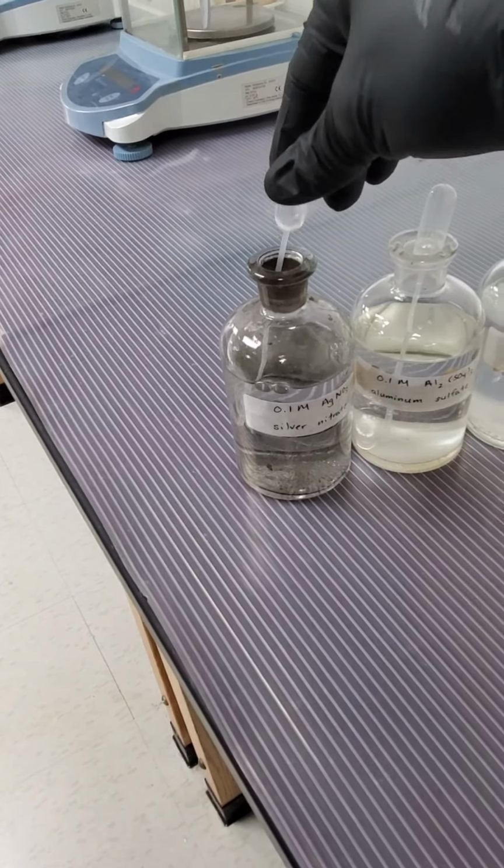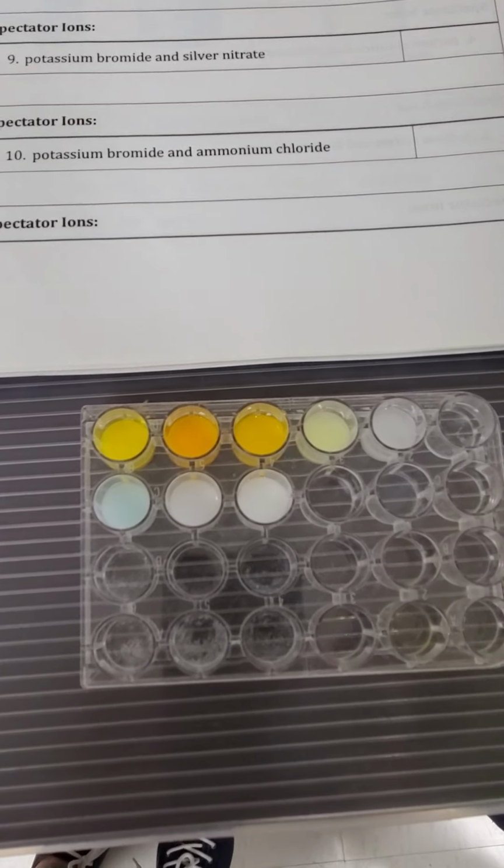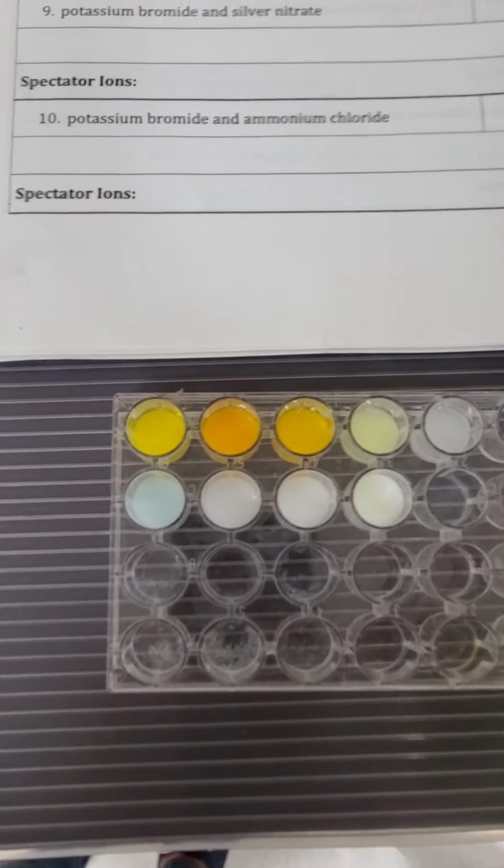Number 9, potassium bromide. And now silver nitrate again. One of those crazy ex-boyfriends coming up, and exactly what we'd expect. Silvers and lead's bad for that. Lastly, we have potassium bromide.